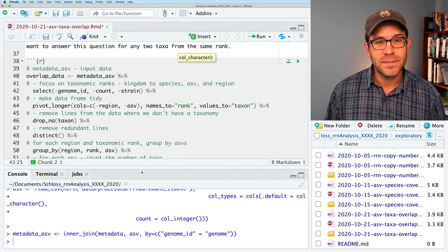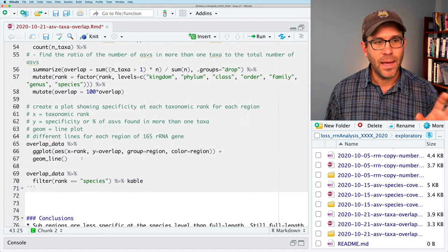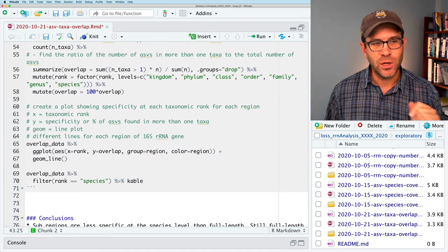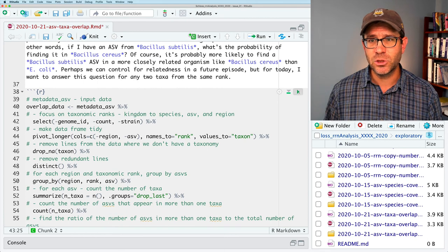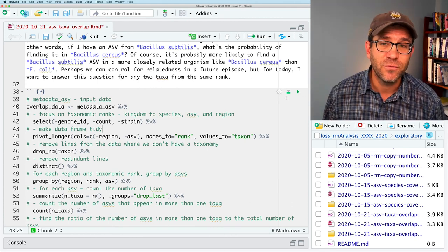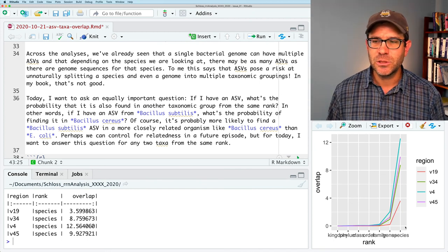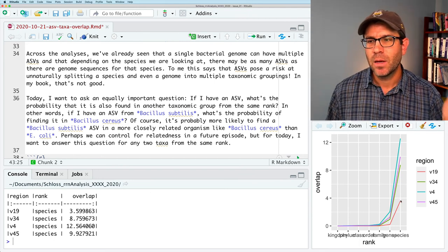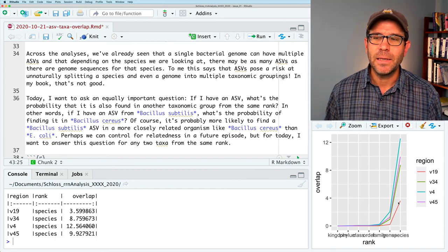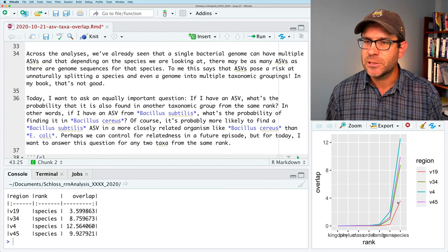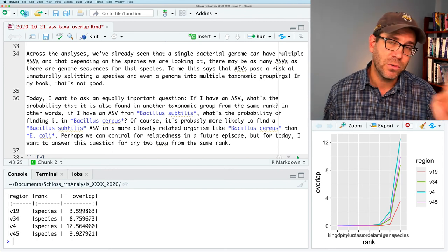We also recall that in the last episode, we generated the overlap data frame and then plotted it, and also generated a data table using kable. Running this chunk, we can see our kingdom-through-species table with our four different regions. As we saw last time, the full-length V1-9 data has the least overlap at the species level—about a 3.6% chance that one ASV could be found in two different species.